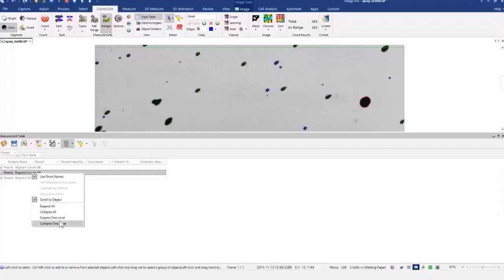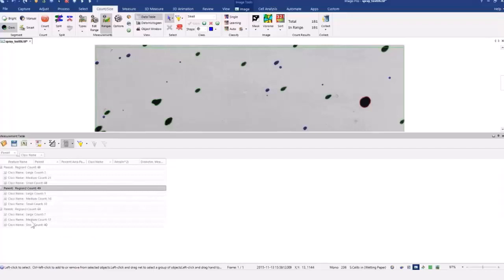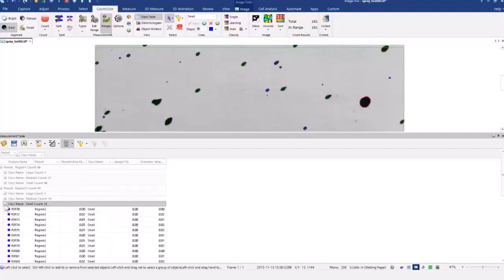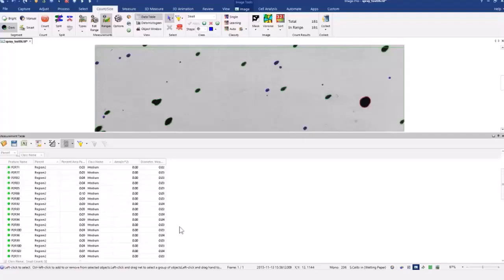If everyone's ever seen this part, I can collapse all by just simply right-clicking. And I can take region two, tells me how many objects are in. If I wanted to look at the data, I could say expand one level. And that will tell me, within that particular region, one large object, 16 medium, and 32 small. I can always look at the individual data within region two. So this is how you go about doing distribution analysis within parent regions under ImagePro10.